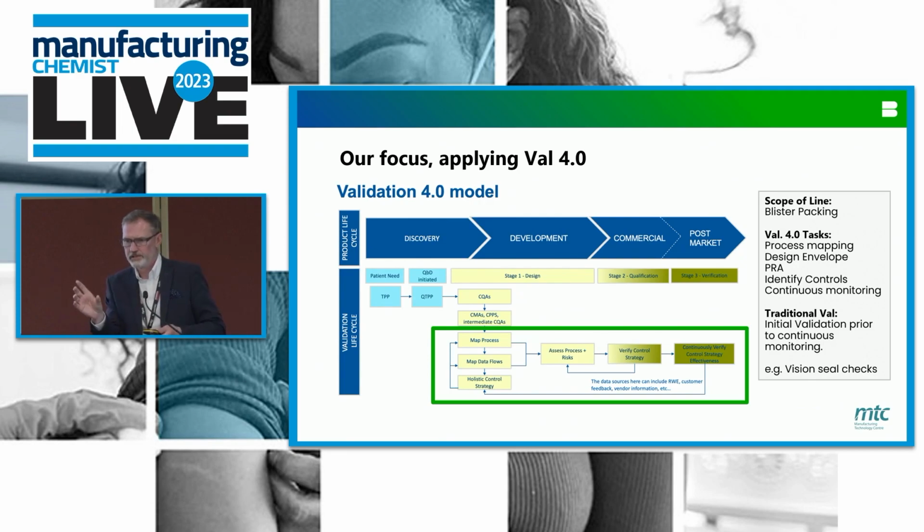In the first instance, we've got to validate that piece of equipment using traditional techniques, but then we aim to show by monitoring the data over the life cycle that we are within the parameters that we originally set, and therefore in the future you could accept that equipment and just use continuous monitoring rather than doing the upfront validation. That is our aim. We'll see in due course whether that is borne out.